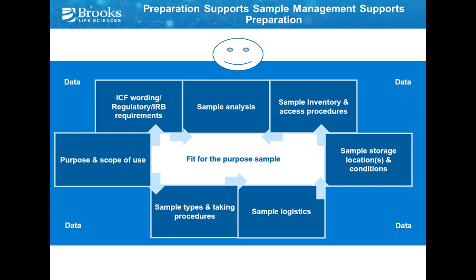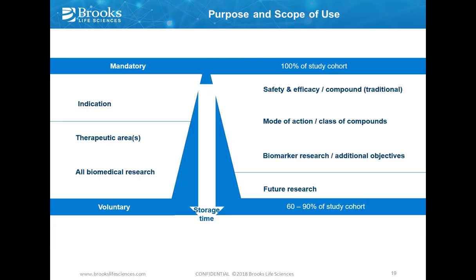Okay, then at a later point, of course, we also need to access our samples and having a good sample inventory in place so that our researchers and every other stakeholder can really see what we have there to come up with ideas to do their research. Planning is another important building block in the concept of being really prepared for setting up a good sample collection, a long-term sample collection. In the end, all this together enables us a sample analysis as we wish or foresee it. Yeah, easy to select the samples, having the right samples in place, and of course being allowed to use the samples for the purposes we would like to use them.